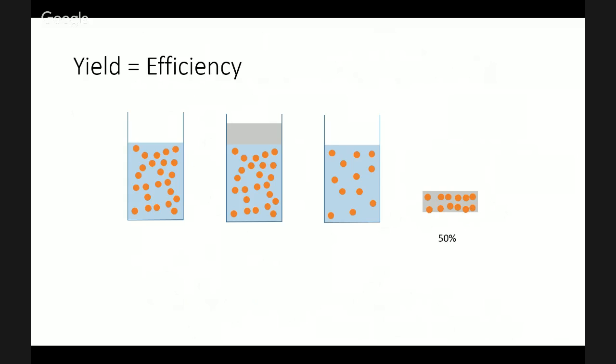But you can see that this wasn't 100% efficient. So some of the iron did get left behind. Now, 50% might be an extreme case here, but if we then made a measurement of that and we tried to back calculate the original concentration in the water, we'd be 50% out, which is a lot. So we need ways of figuring out what this yield efficiency is.